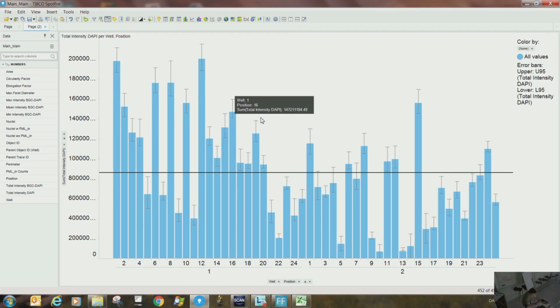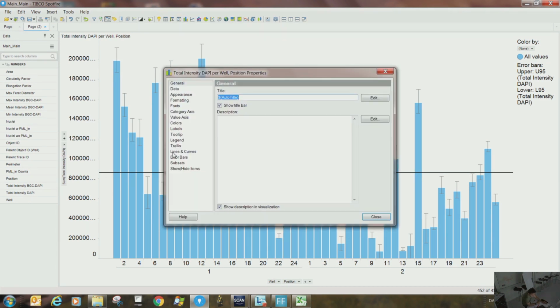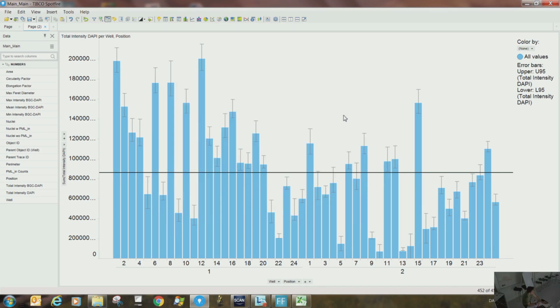So this is all about position. Well, the error bars subset is not important for you guys, nor is show height. So we have studied all the properties that you can control for plotting the bar chart. This is just one visualization, but there are so many other visualizations one can utilize to pose different questions and get different answers. It all depends on the scenario.